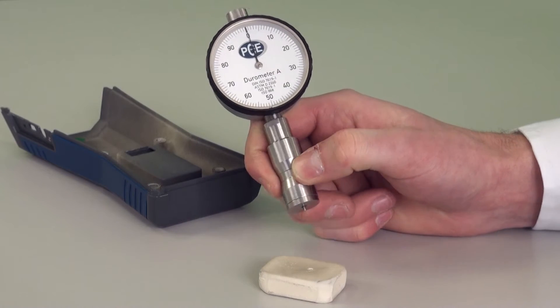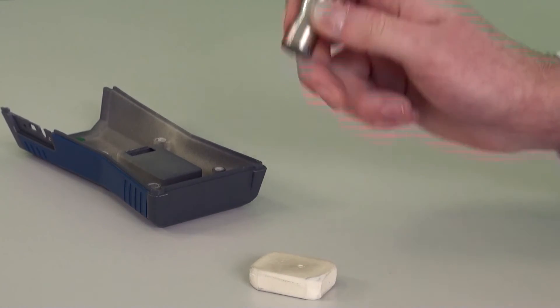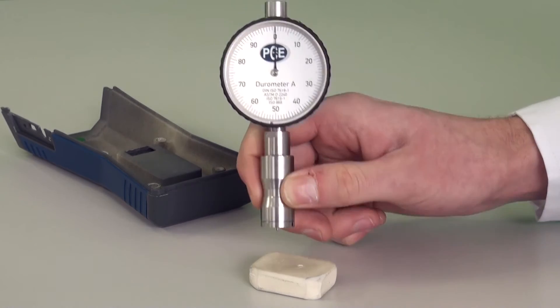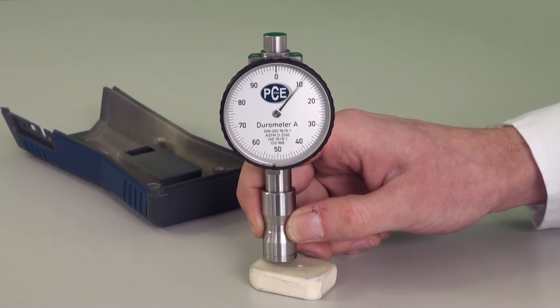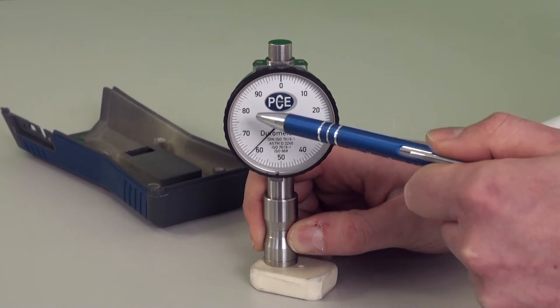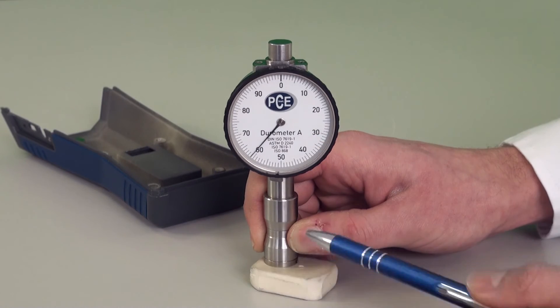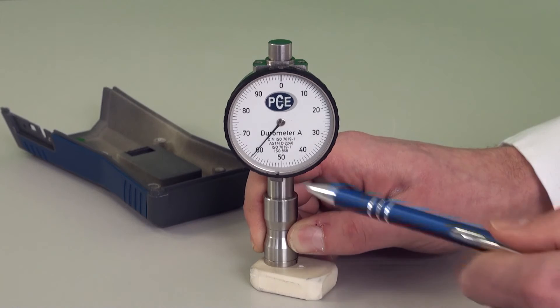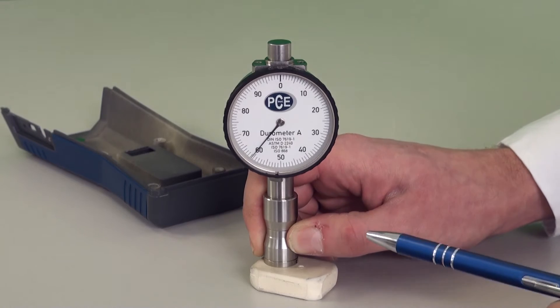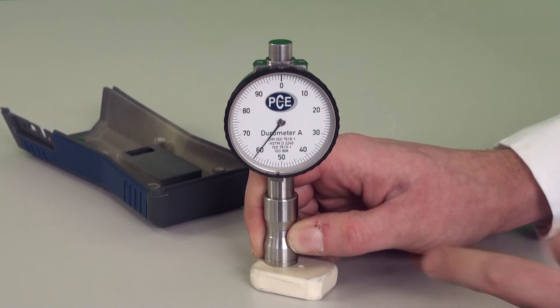We will now do a measurement with the durometer on a rubber part and on an injection molding where the rubber part is applied. For this you simply take the durometer and put it flat onto the surface. You see the stroke, and as soon as the pointer goes a little back you feel that the rubber relaxes. When the pointer is stable we can read the value. We have here a hardness of around 60 Shore A with this rubber part.